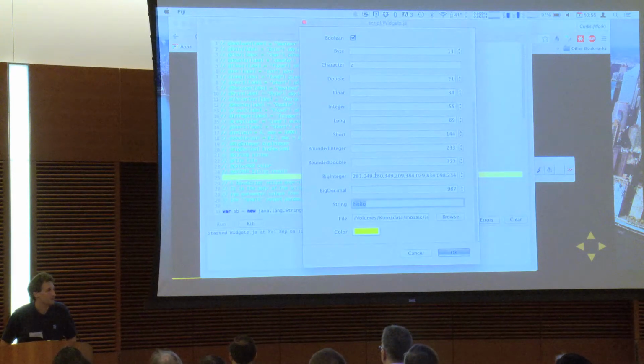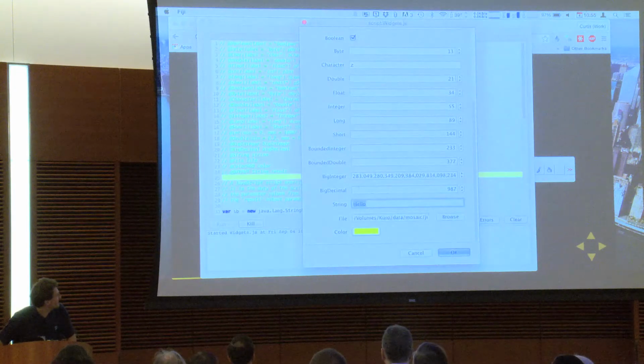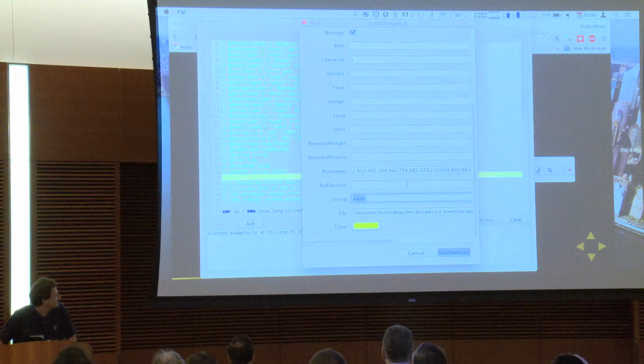We do not yet support complex in the UI. Adding that stuff would be very straightforward, especially complex, because it would just be two, I assume. I mean, we support matrices and then we support images. So first, okay, I'll get to this in a couple of slides.